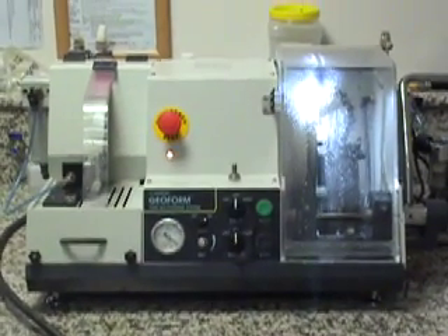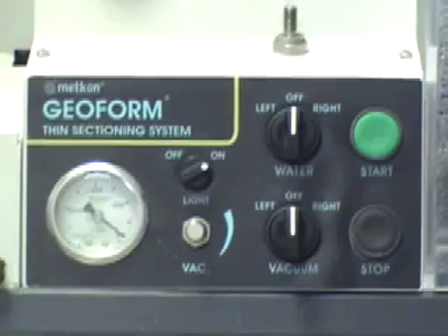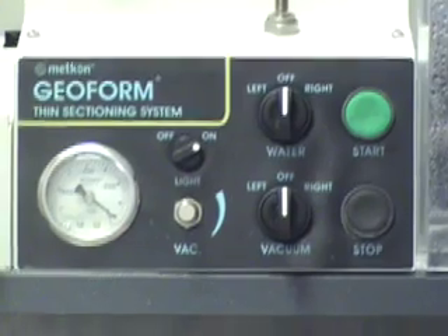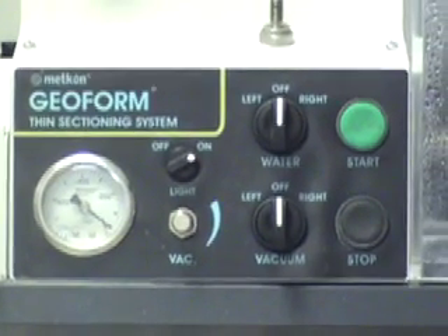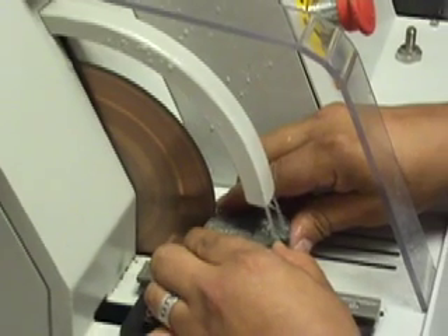The Geoform Precision Thin Section Cutting and Grinding Machine is for precise material removal from petrographic thin sections. It's an easy to use two station machine for cutting and grinding.